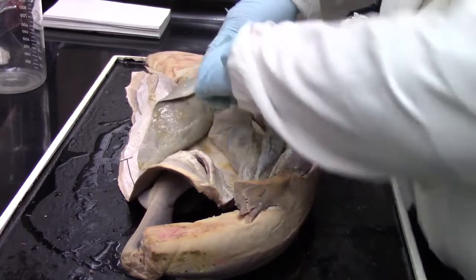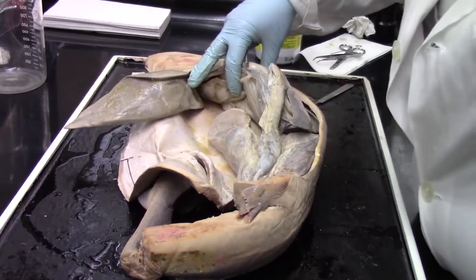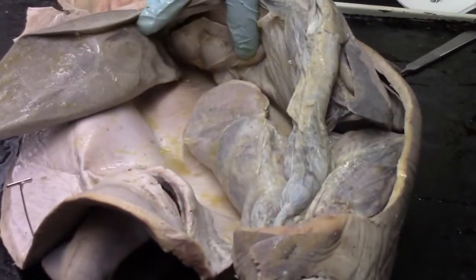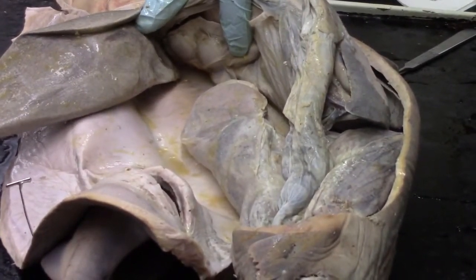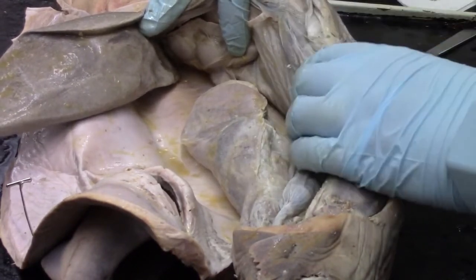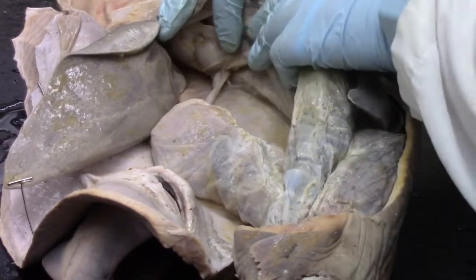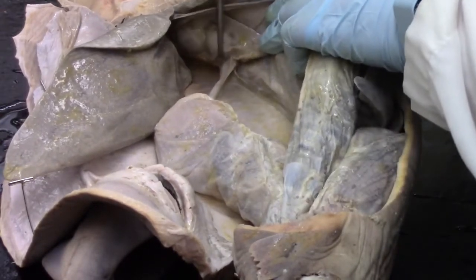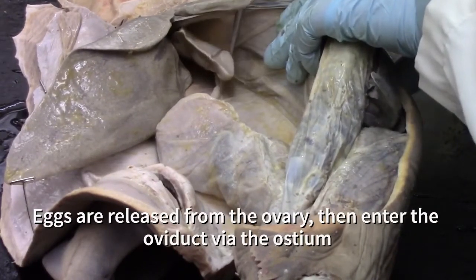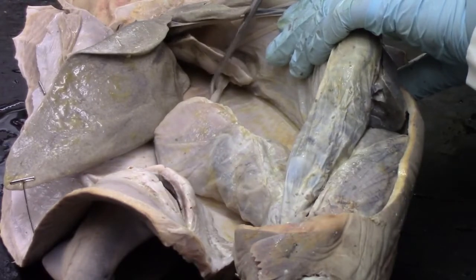I'm going to try to zoom here and see if you can actually see there is a little bit of an egg shape going on there. So right between my two fingers there, you can actually see the definition of eggs that are developing in that ovary. From the ovary, the egg would be released via the ostium, which we're not really seeing right now just because of the angles, and it would make its way into the oviduct.